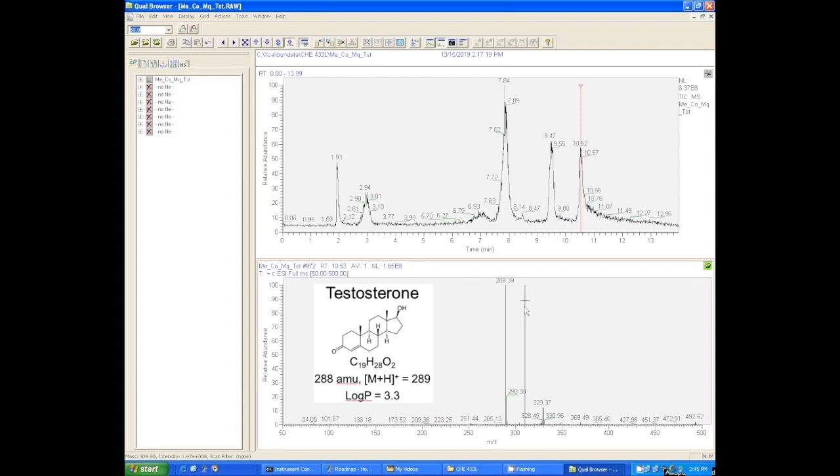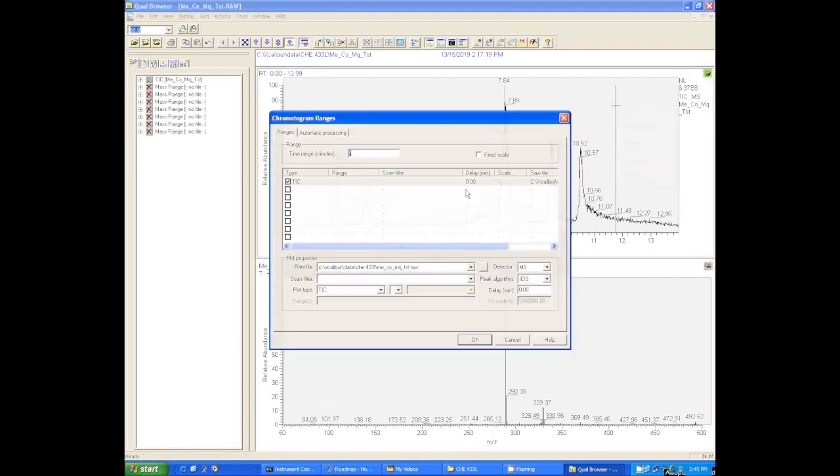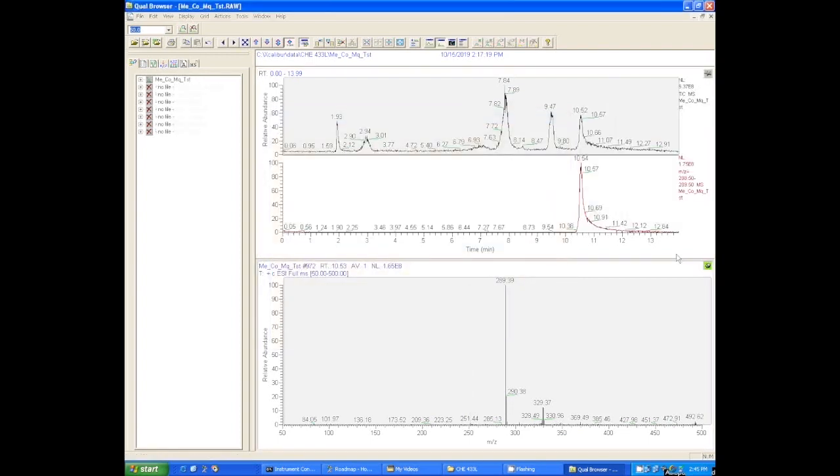So if I had some mixture where I knew testosterone was in there but my chromatography didn't go well, I know I'm looking for 289, then I can go ahead and put the thumbtack on the top spectrum, go to ranges here. And right now I'm displaying the total ion chromatogram, but I want to put a second chromatogram on there and say show me the chromatogram specifically for 289, so only plot that chromatogram where the axis is 289. And you can see this cleans up the chromatography beautifully. So now I just see that testosterone peak, and sometimes when you don't even see a peak in the TIC spectrum, you can still get a nice peak and pull a mass spectrum from that if you do one of these chromatograms where you select a specific mass.